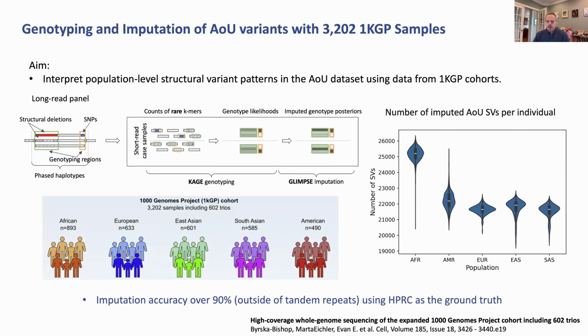So another thing that we can do, and this will become important later in the talk. Most of the analysis is based on HiFi sequencing, right? This is going to let us access parts of the genome and types of variation that have never been seen before. In round numbers, for structural variants, you get about 2 to 3 times more variants detectable using long-read sequencing. Again, as I said, about 25,000 variants per person using long-read sequencing, even through T to T assemblies, about 25,000 variants.